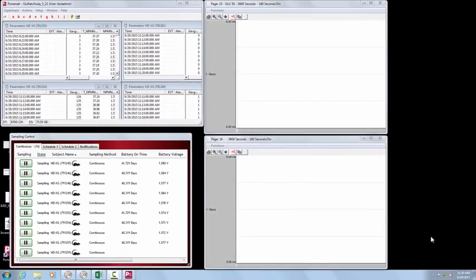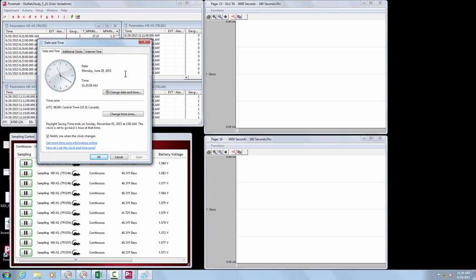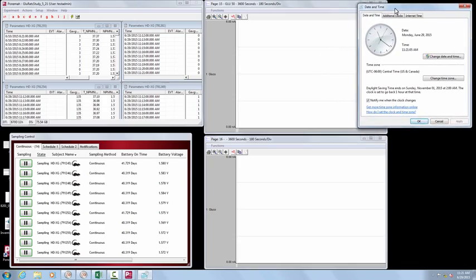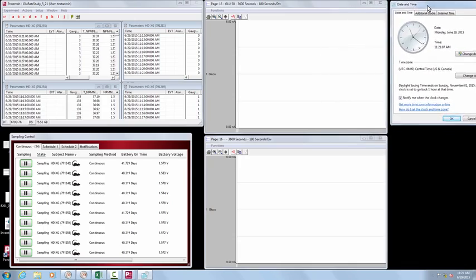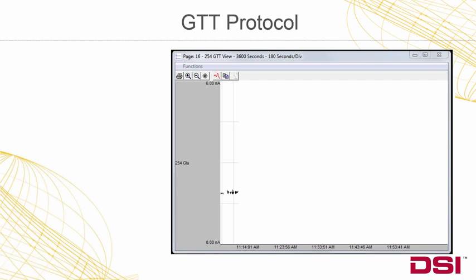To assist in keeping track of critical timings of the calibration events, we will position a computer clock prominently on the screen such that the hour, minutes, and seconds are clearly visible. The multi-point calibration procedure is most simply performed by collecting two reference points during a glucose tolerance test. The following animation explains the process.